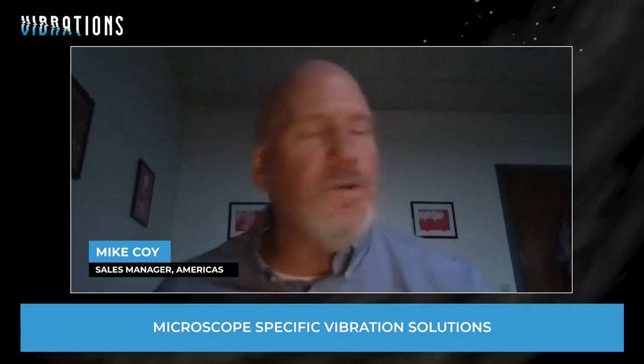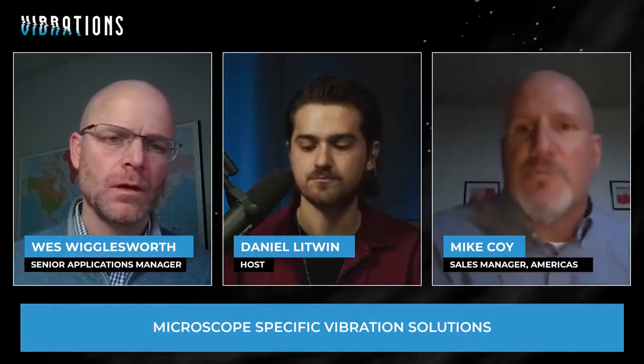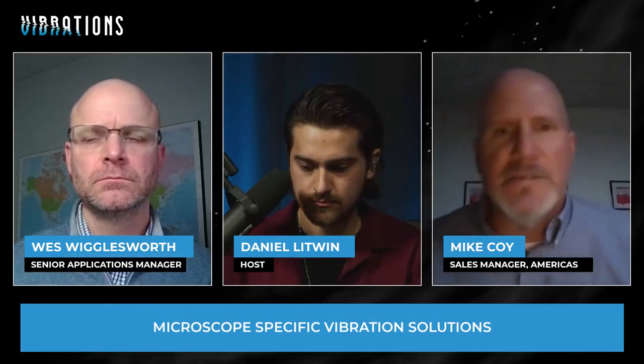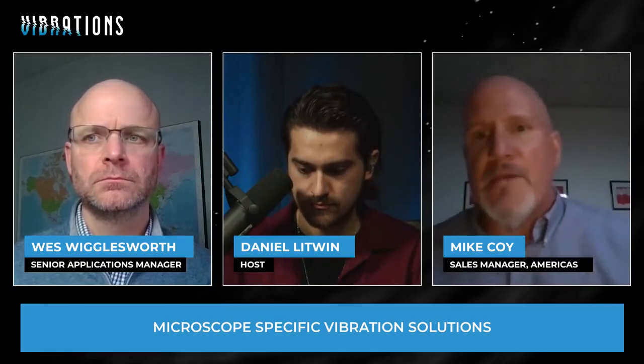I talked to a customer just last week that's going to buy 3 different microscopes. Each of those has different vibration requirements based on the type of instrument it is. And their question is, where should we put each one? Which room is the best, because we want to put the highest resolution tool there. This instrument's not quite as demanding, so it can go in this room over here that maybe is closer to the elevator or whatever other feature may be.